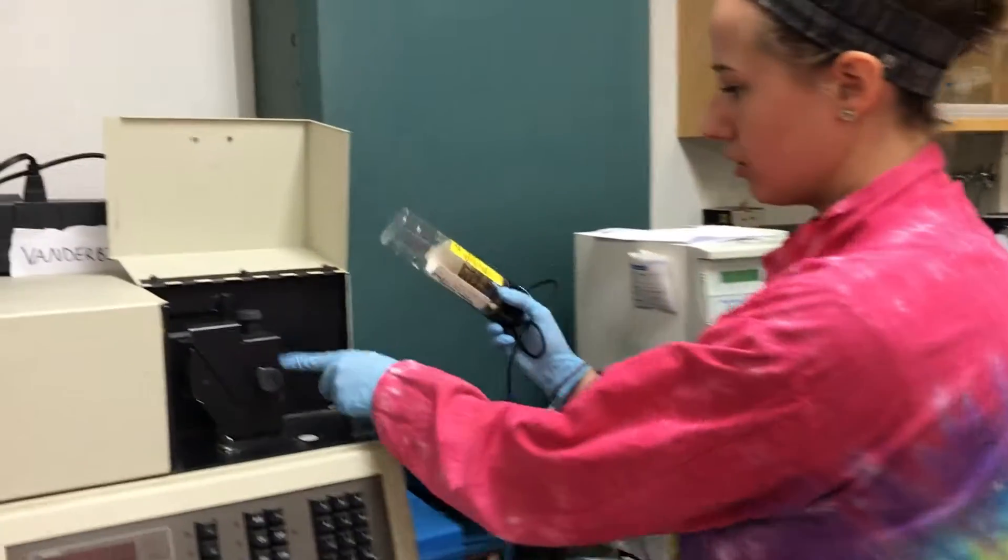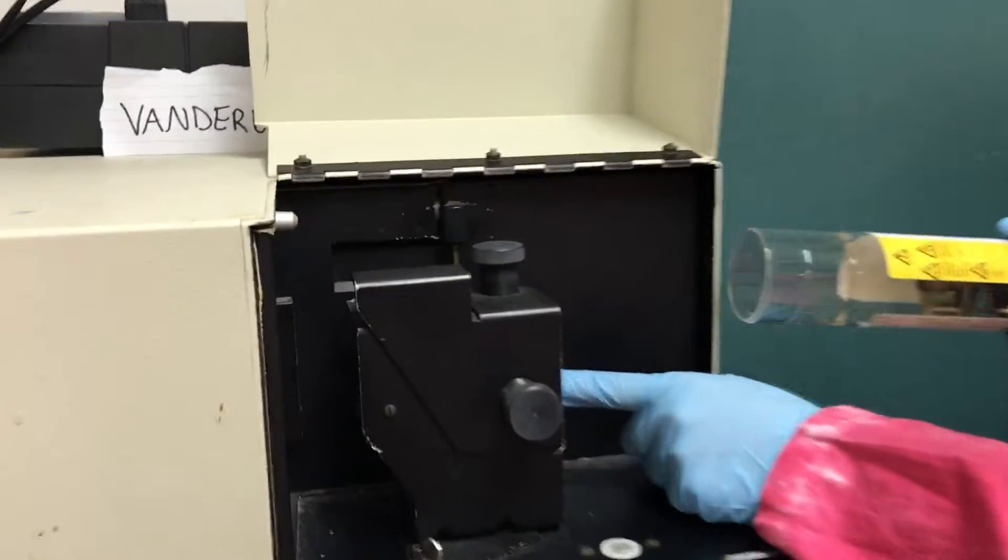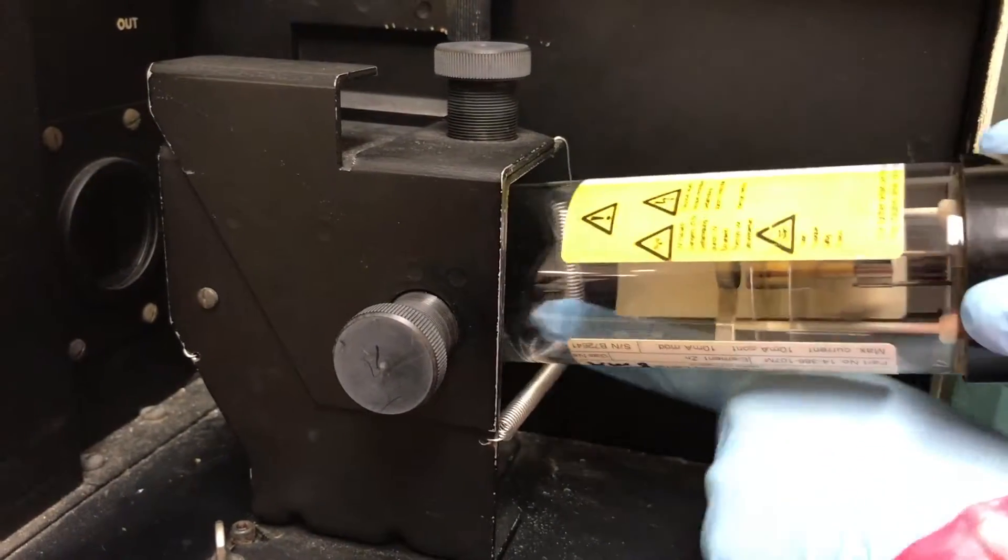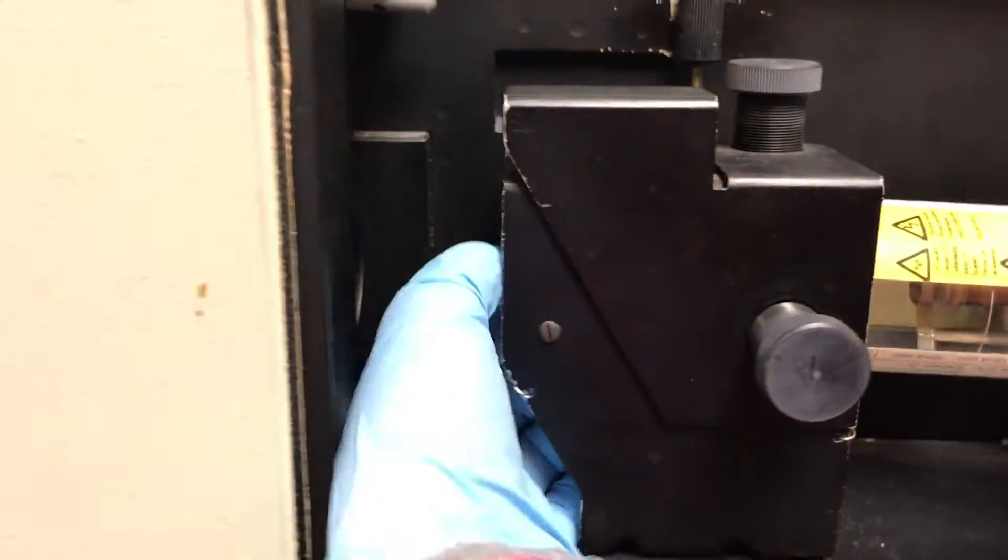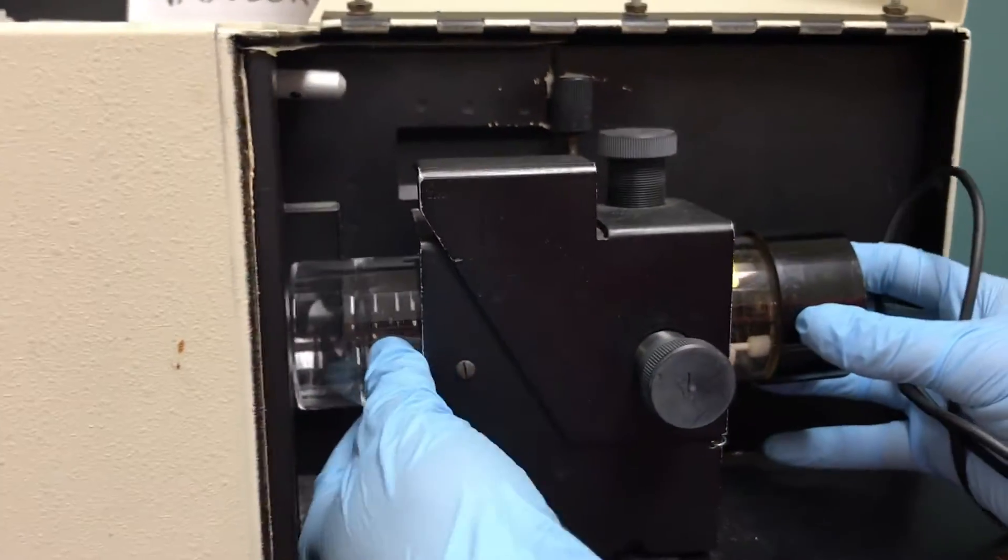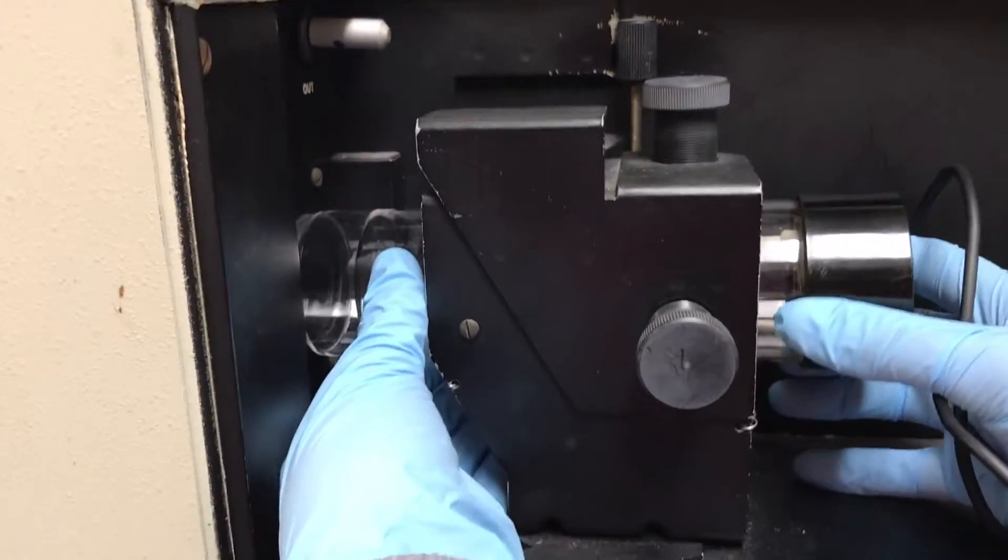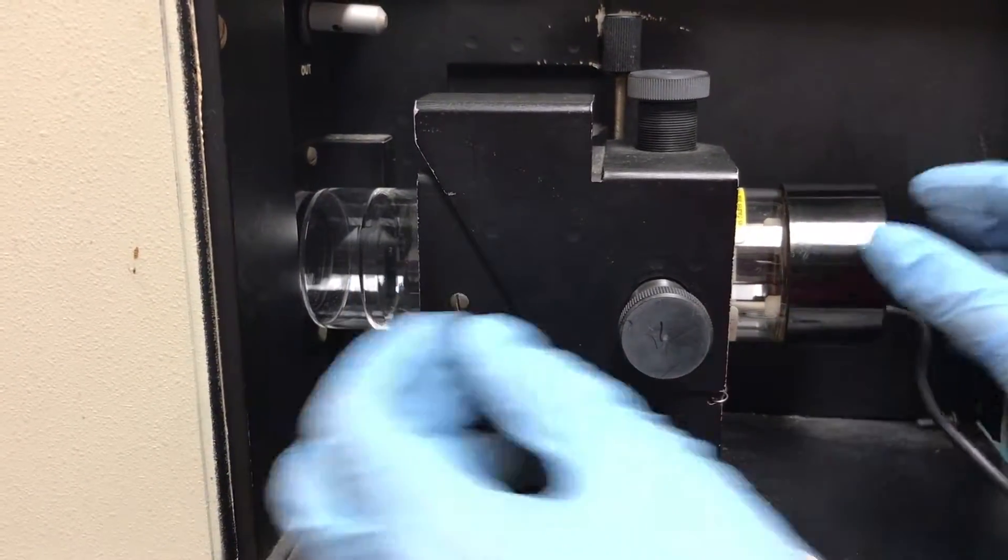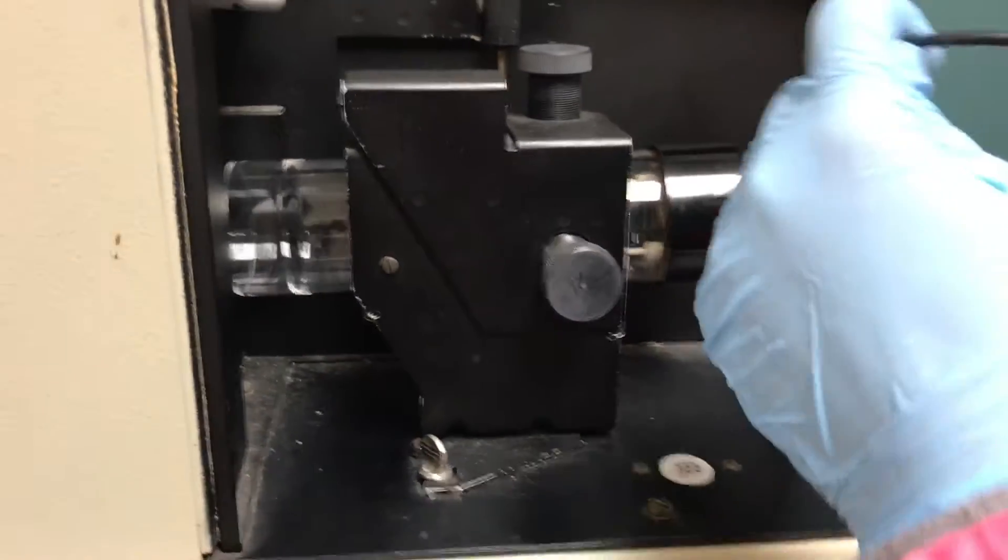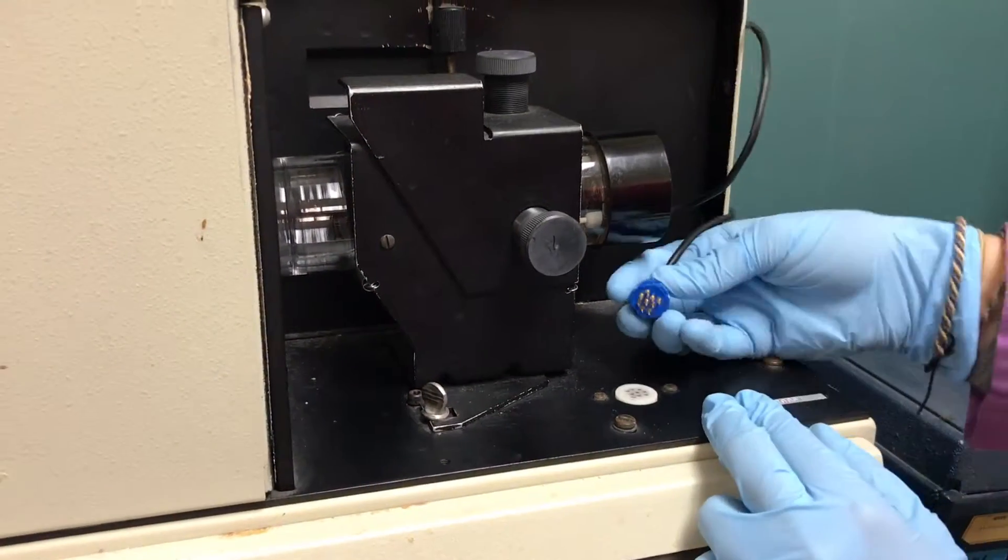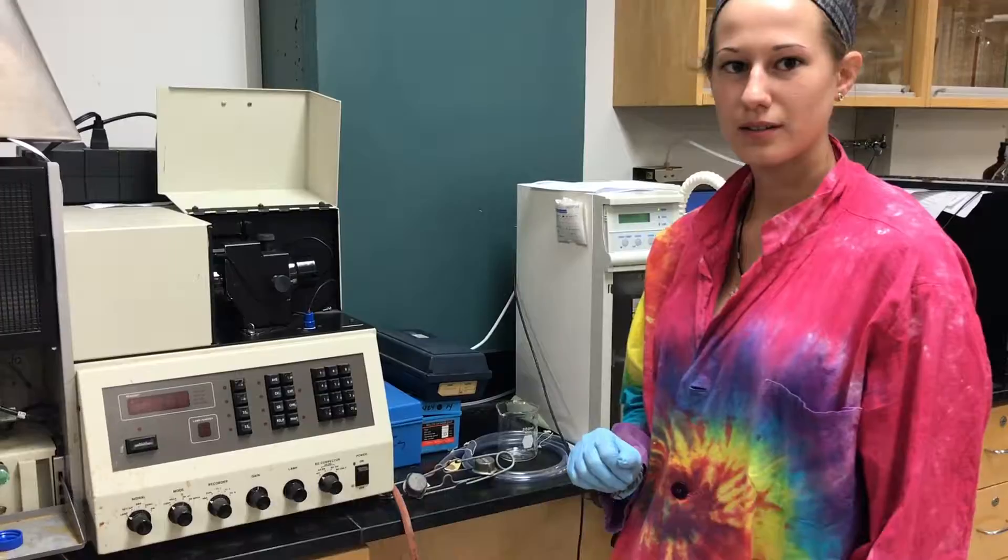This hollow cathode lamp emits a wavelength that is similar to the wavelength that zinc absorbs. To insert the lamp, you pull on these springs here, insert it carefully. There's another one on this side. And push the lamp all the way through until it just touches, and then slightly pull the lamp back so there's a small gap in between the lamp and the instrument.